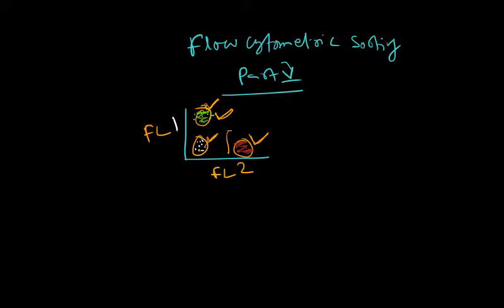Now for my study, I want all of these populations separated. My requirement is I want to do a downstream transcriptome analysis for all these three populations, and I need them separated. However, my sample is heterogeneous and all the cells are mixed together. In order to separate these cells, there are other methods that can be employed, but flow cytometry offers multivariate analysis. So that way it is superior when we are using many parameters as compared to other methods like magnetic sorting or antibody based panning.